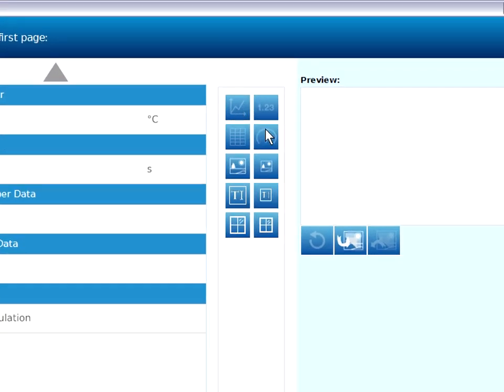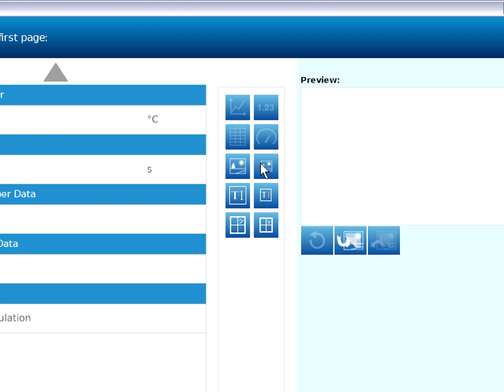Starting at the top, we can see there are four data displays: graph, digits, table, and meter. There are page elements for images, large and small, and text boxes, large and small. Now there are two columns. The items on the left column are large page elements, occupying more space on the page than the small elements on the right.